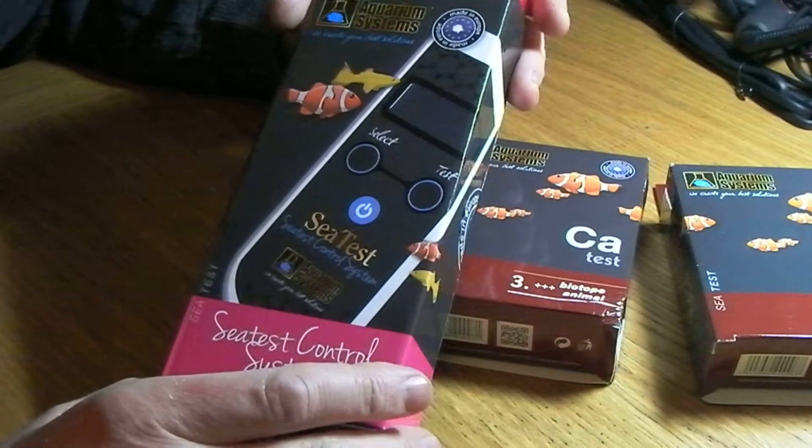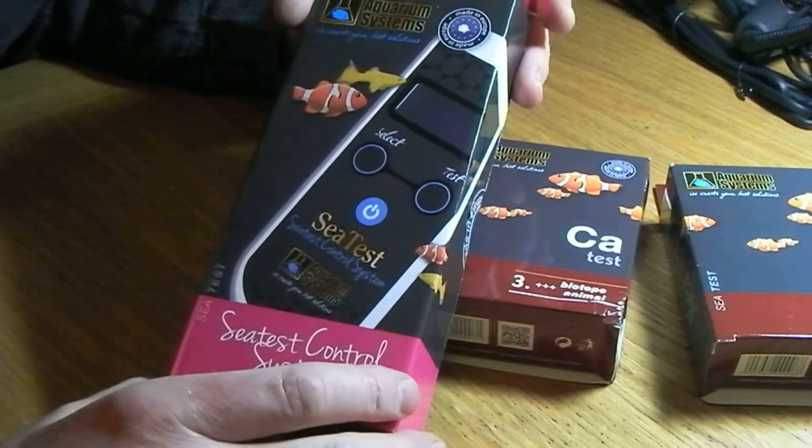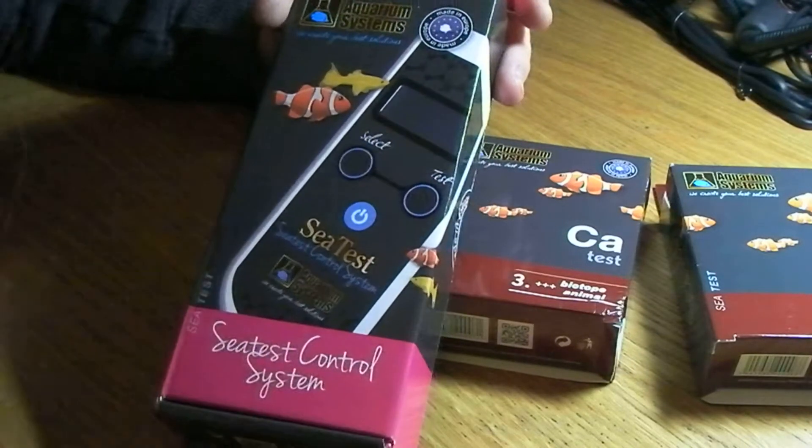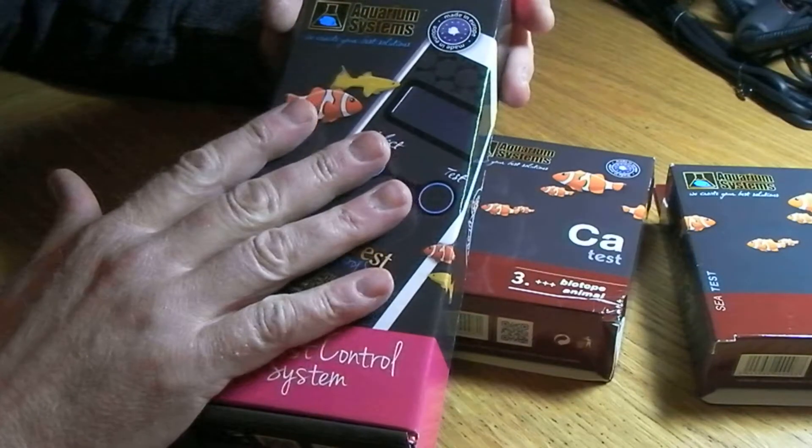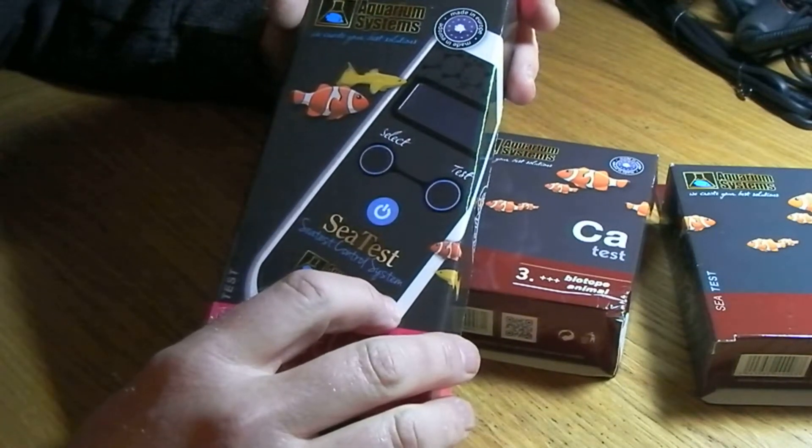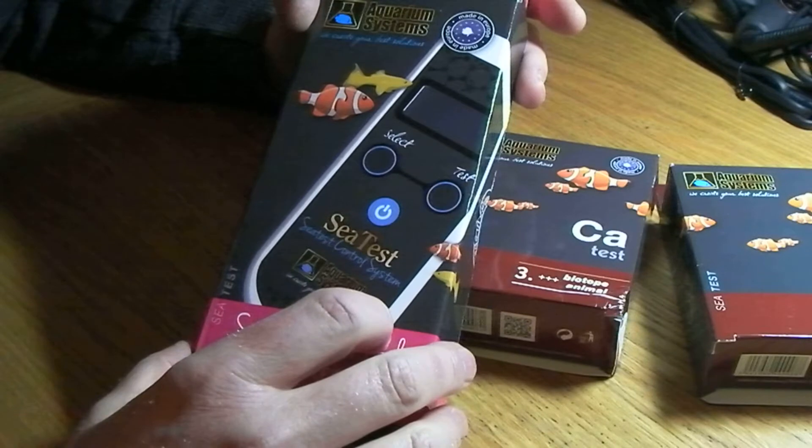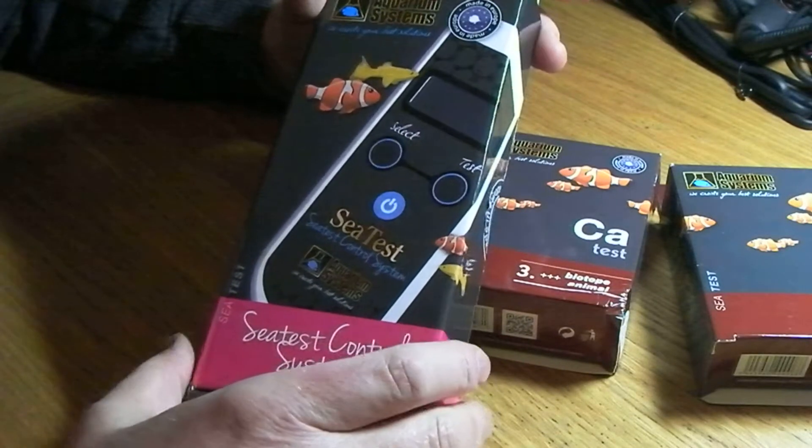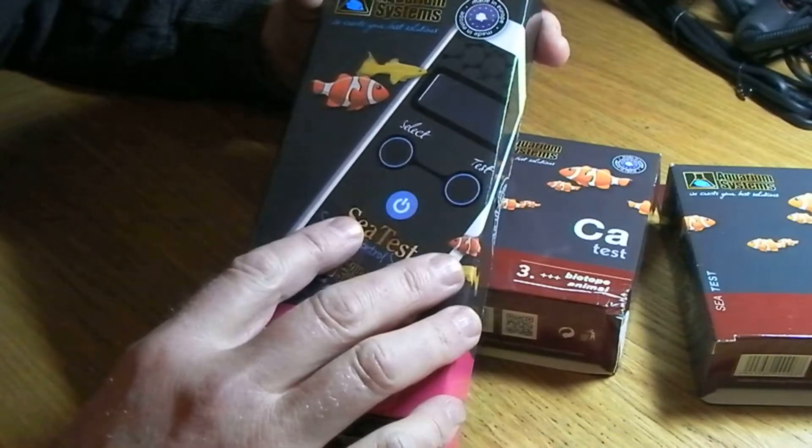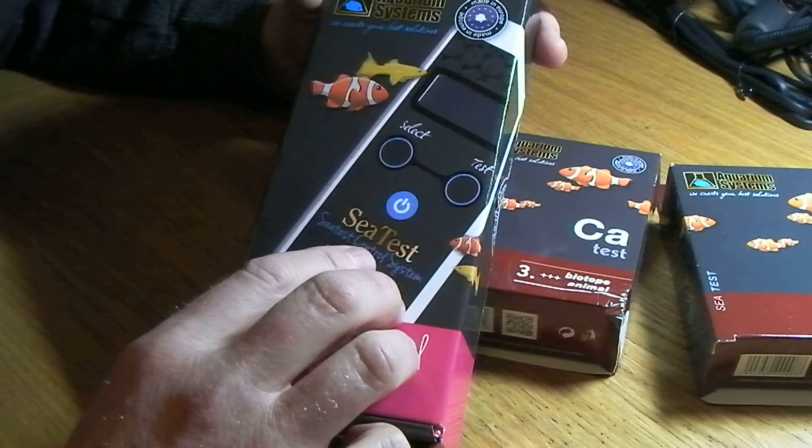Quite usefully, you can actually connect this to your PC and download and store all the results from the various tests. You can actually use the same thing on up to ten different tanks, although I can't imagine any of us have got ten tanks on the go, but perhaps if you're a marine shop you might have ten different tanks.